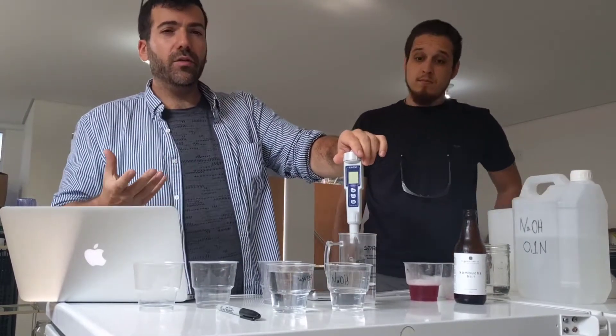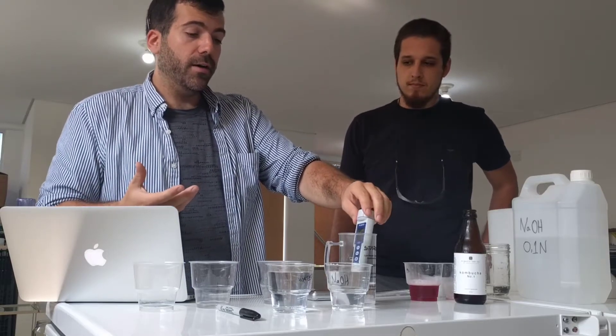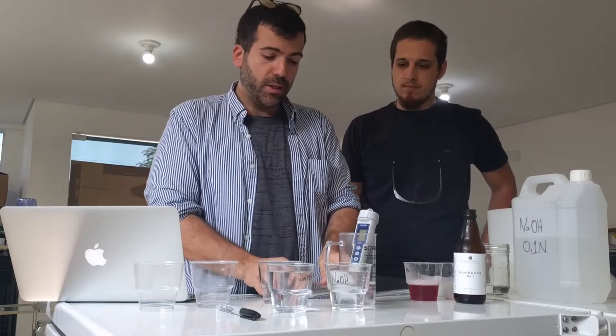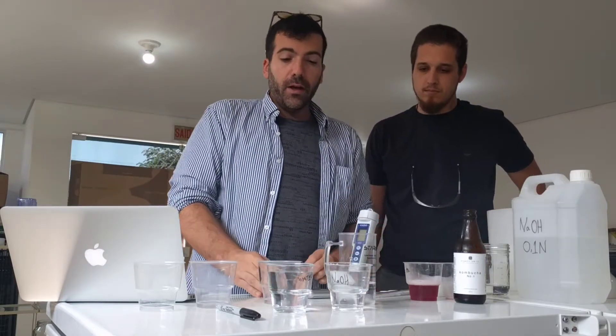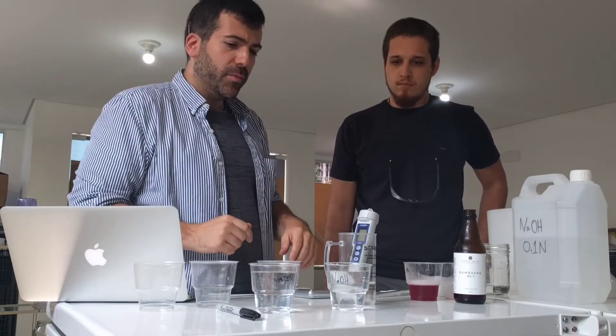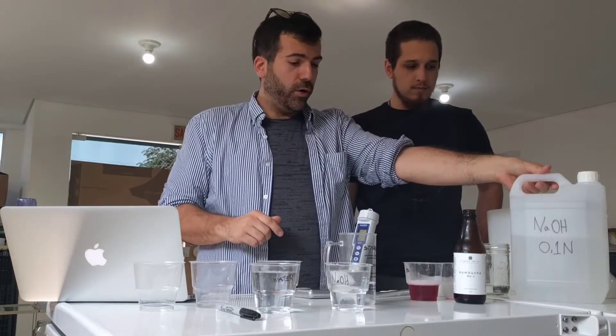What else do we need? A pH meter. People use phenolphthalein but I prefer a pH meter. It doesn't even need to be a very precise pH meter — we're using only one decimal, so like 7.1 but not 7.01. We need a scale with at least one decimal point in grams that's relatively precise. We're gonna need some water — ideally still water — and then some NaOH at 0.1 normalities.